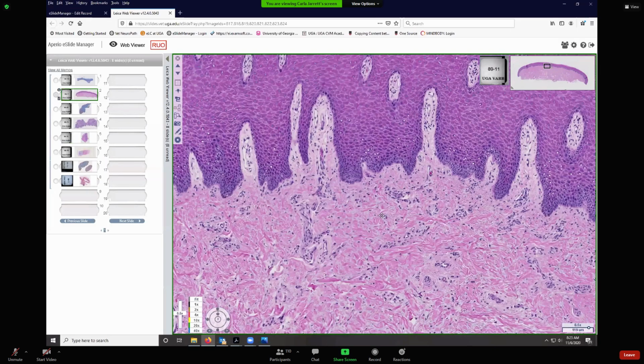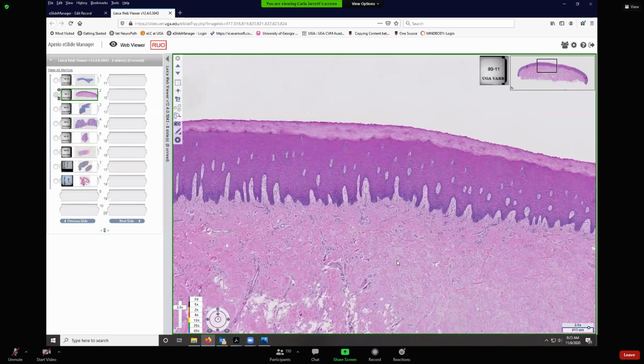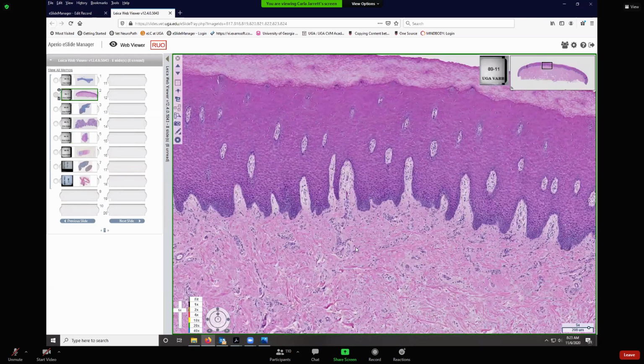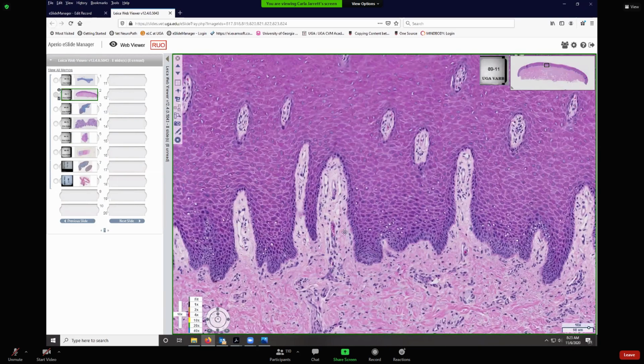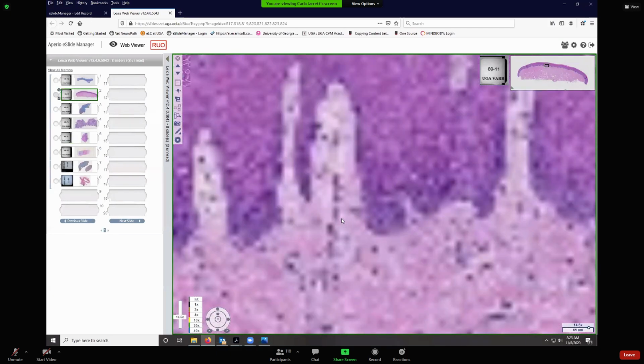So just outside of the basement membrane, you'll always have loose irregular connective tissue, but it may be so thin that it doesn't really stand out like in that other slide. That is the papillary layer. Outside of that is called the reticular layer. Those are the two subsets of the dermis. This would come off when you're skinning that epidermis and dermis off of the cadaver.